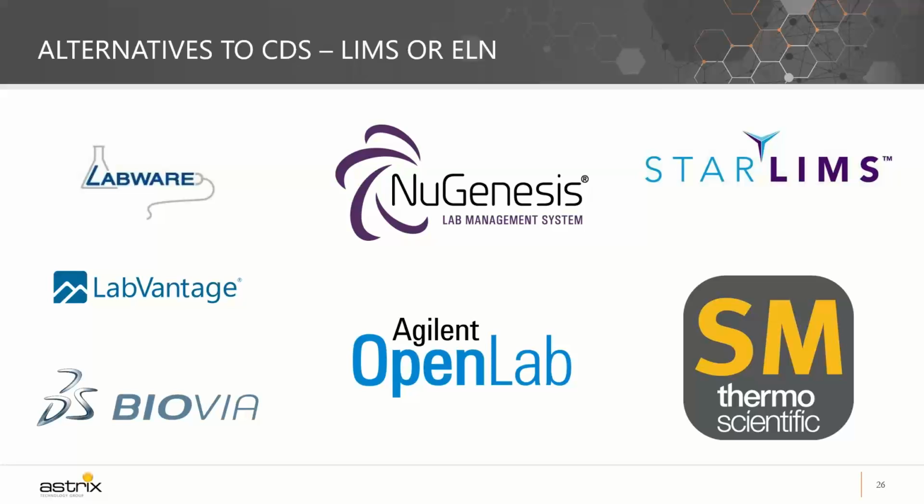Another weak scenario for LIMS and ELN is when you are manually transcribing information from one system to another. Let's say you do not have automated integration between them, so you have to actually print the results and type them in on the other one. So anytime a human manages a numeric value, there's a risk that digits in that number will be transposed in a small percent of transactions due to typos or something like that. So that's one thing to have in mind.